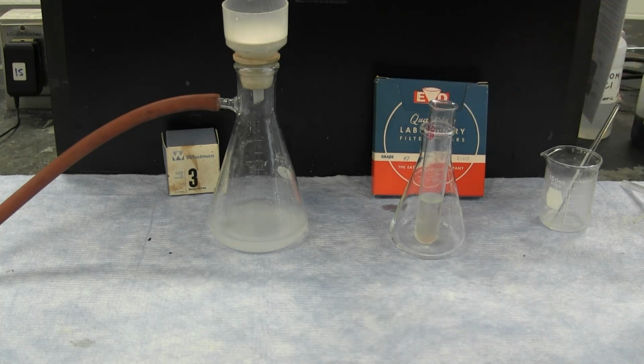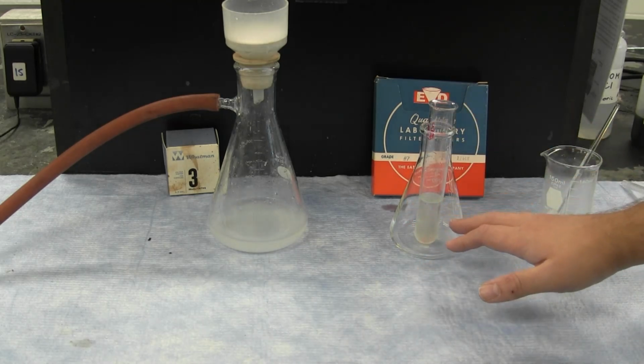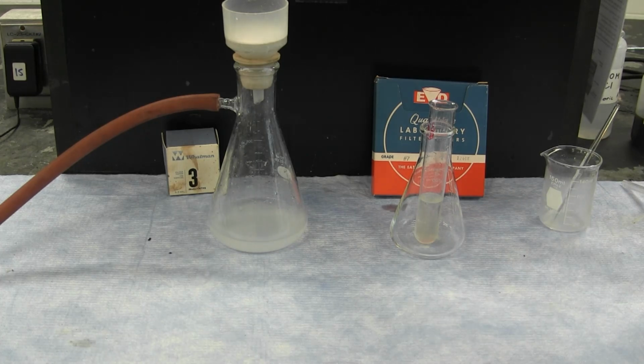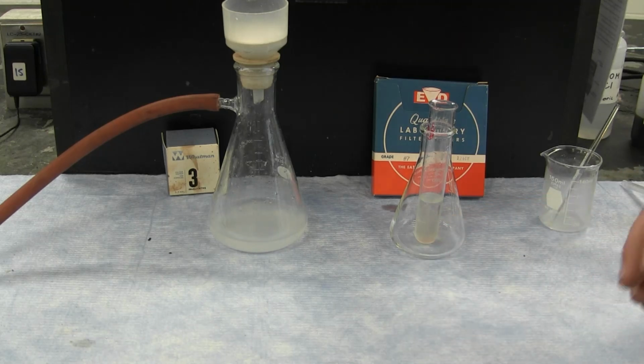Each of the original reactants is added to separate portions of the filtrate solution. Whichever reactant causes a precipitation reaction in that second set of reactions on the filtrate, that would be an indication that it is a limiting reactant in the first setup.